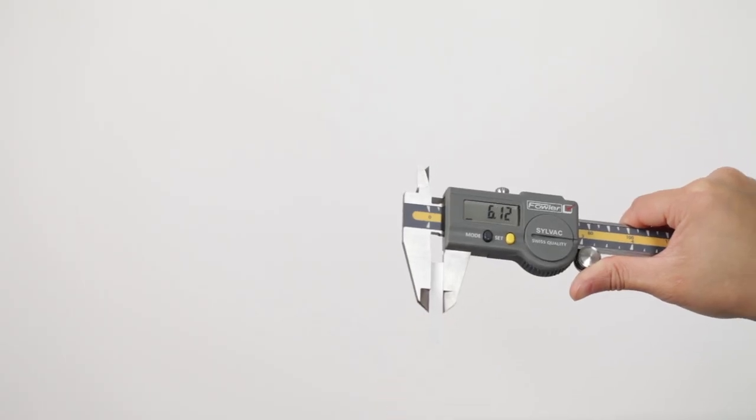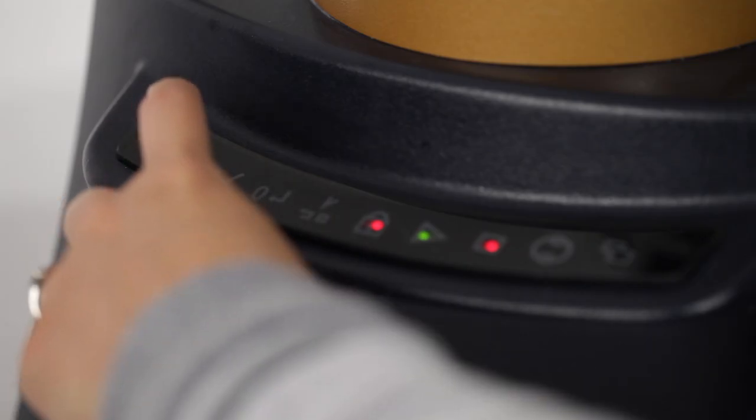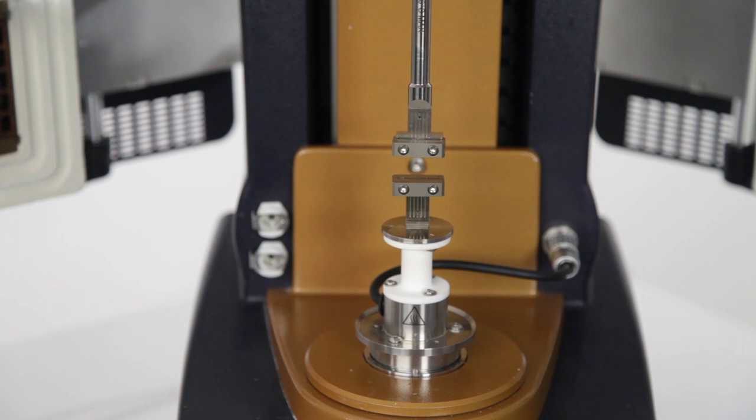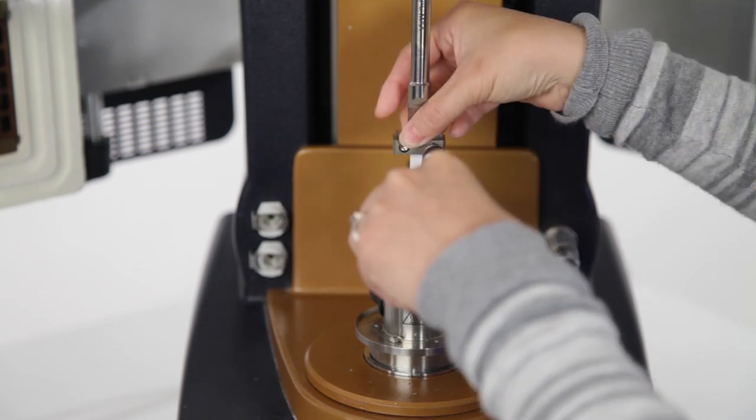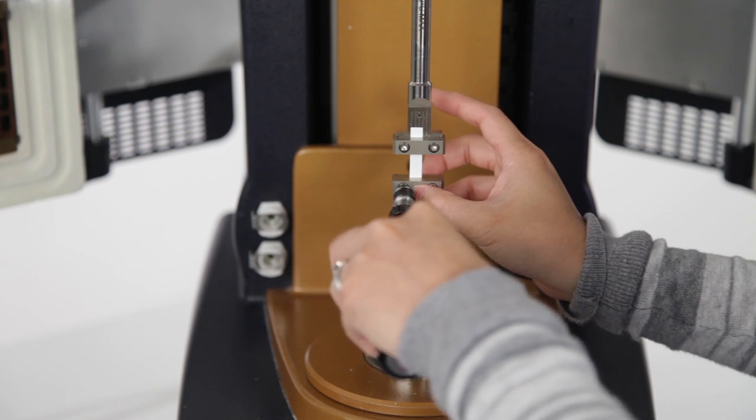Measure and enter the sample width and thickness into the appropriate fields under the geometry file. The sample length value is always measured during a test using the gap signal. Simply raise the instrument head, move the upper geometry to the alignment position, and load the sample into the test geometries. The linear tension clamp is now ready for testing.